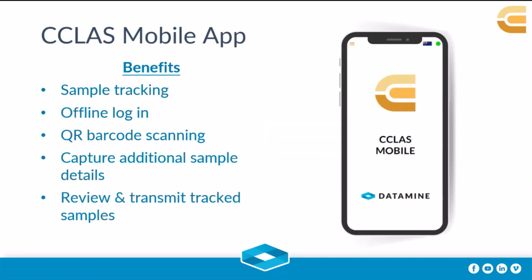All right, so Datamine's new Android mobile app for CCLAS can help resolve some of these challenges that you face in your mine site laboratory. I think the biggest impact for this product is the tracking of samples that are taken in the field. The app automatically records who takes the sample and at what date and time.